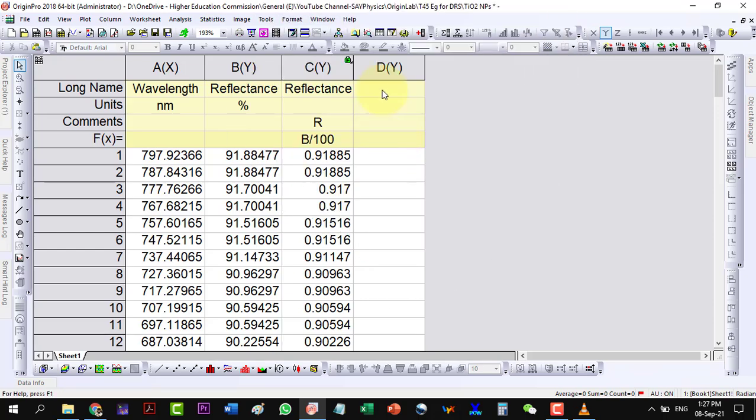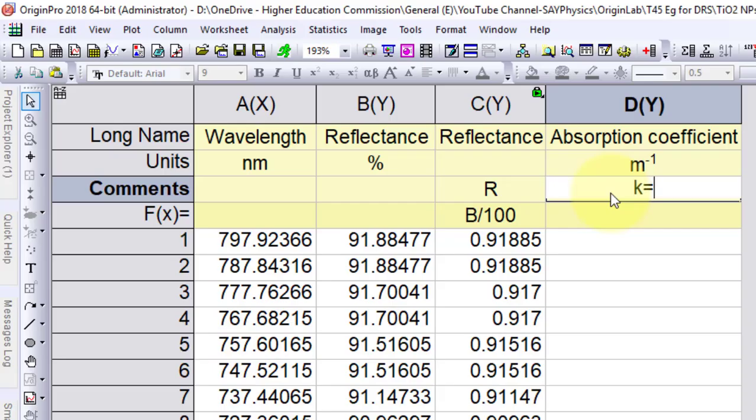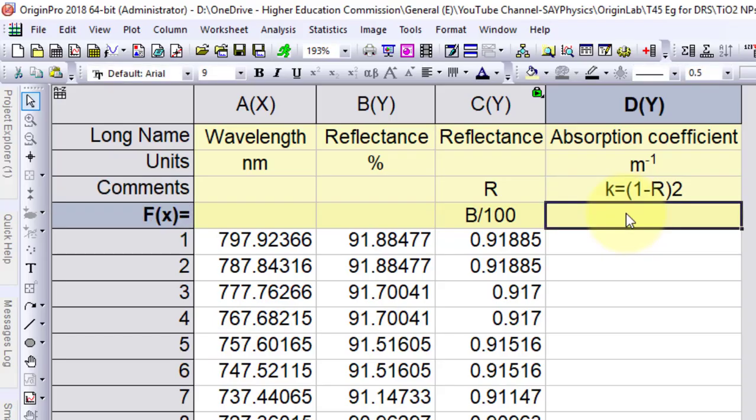Now we will calculate the absorption coefficient k in meter inverse, which is (1-R)², so we can write it as (1-C)².